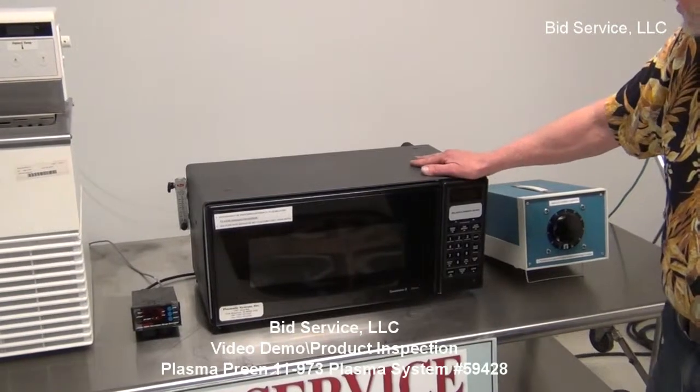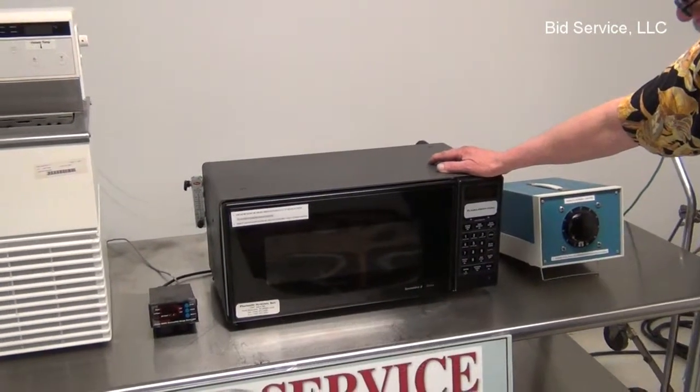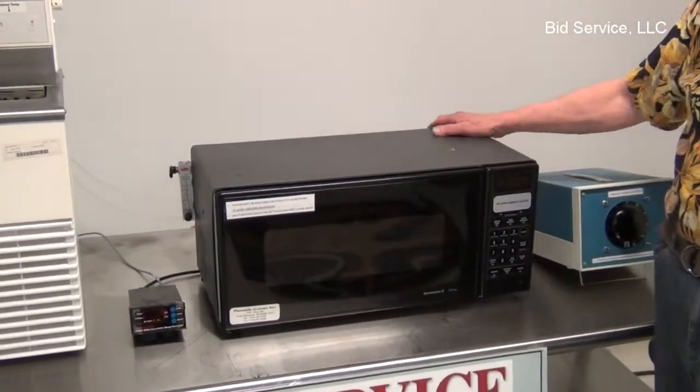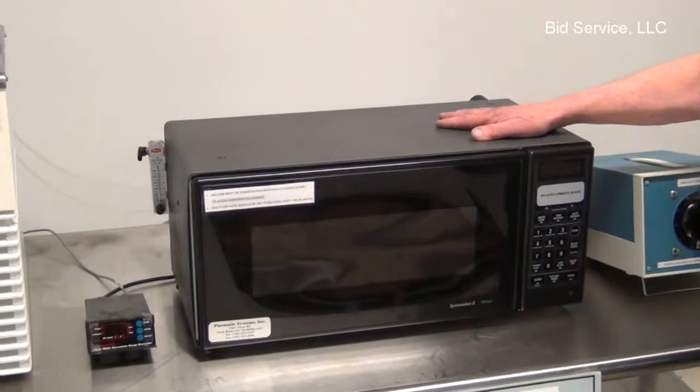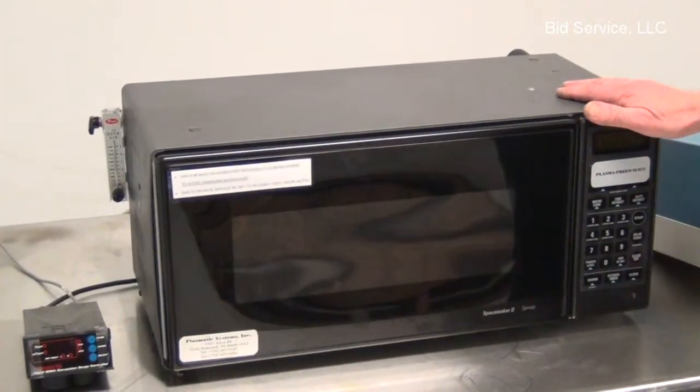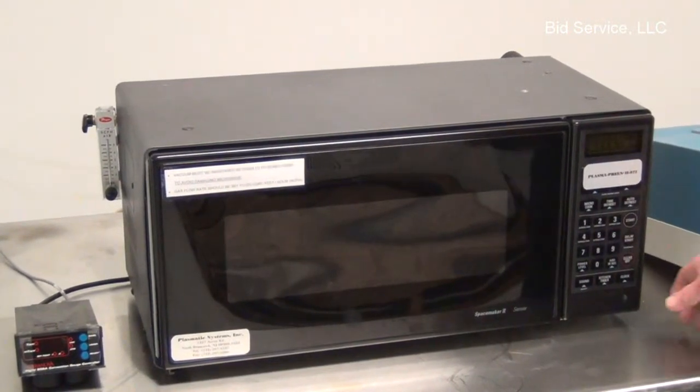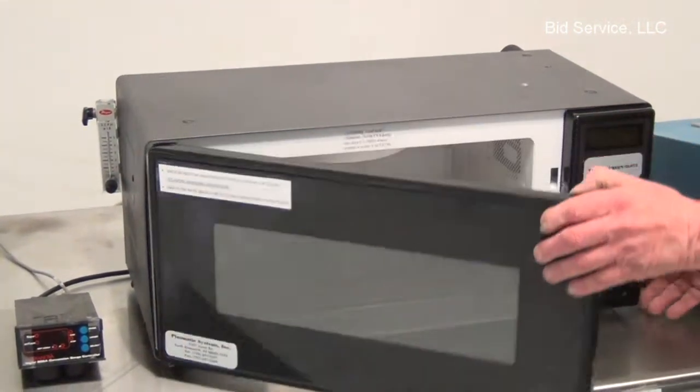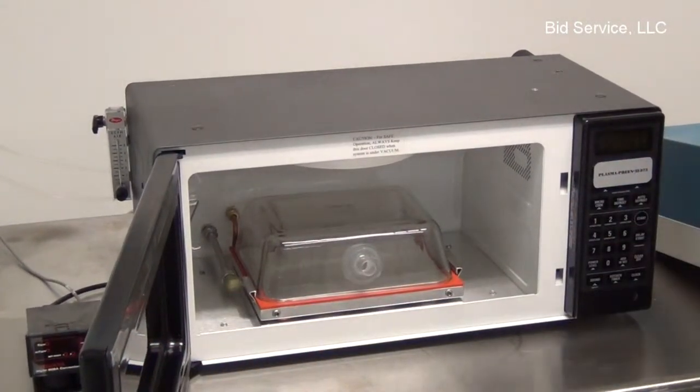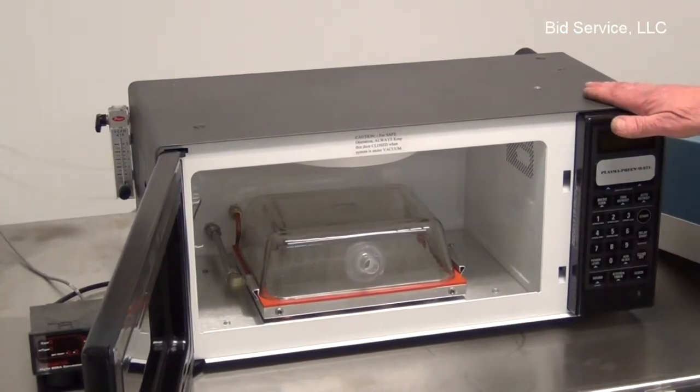This is the Plasma Preen II Plasma Etching Microwave Oven. Now, you might say that this looks like your average everyday kitchen microwave oven, and that's exactly what it is. However, with very clever engineering, this locally based company right here in central New Jersey took a standard kitchen microwave oven and adapted it for use as an actual plasma etch type piece of equipment.